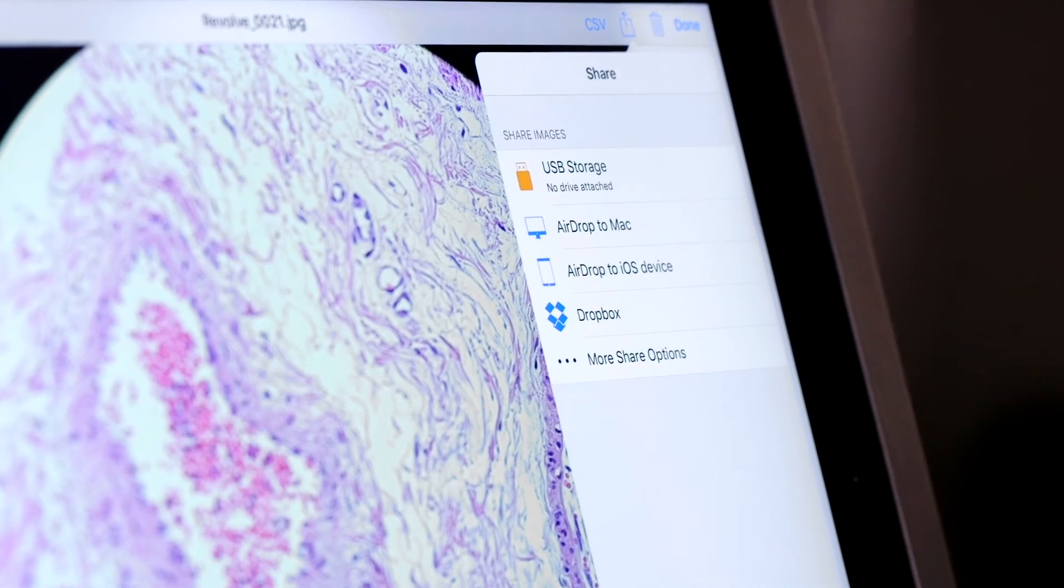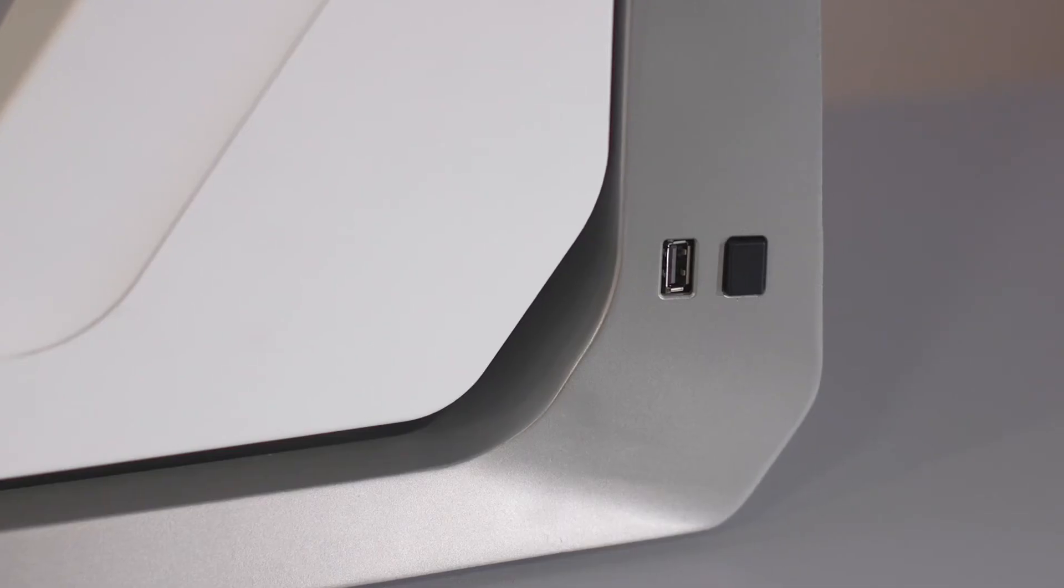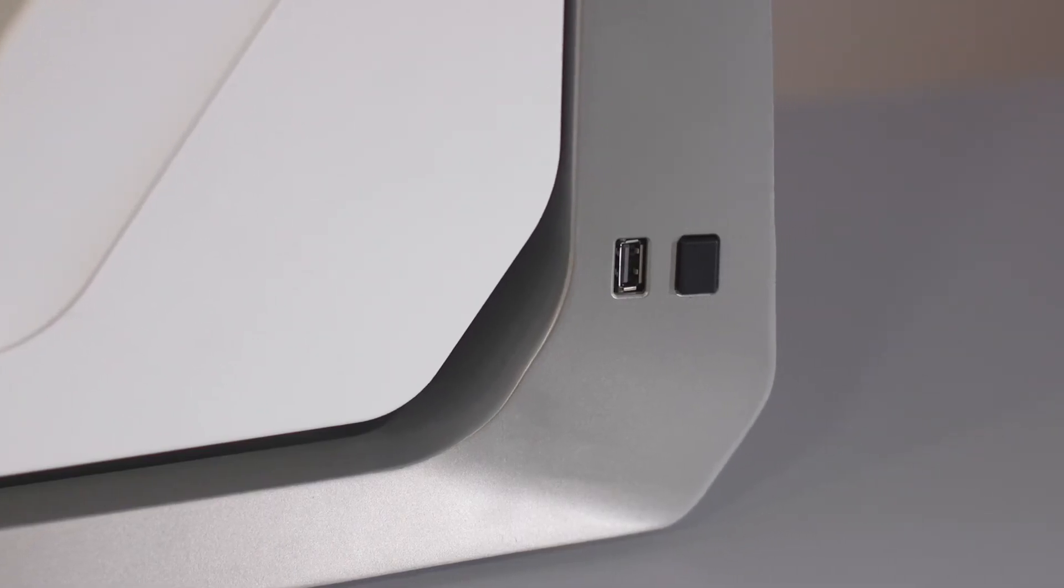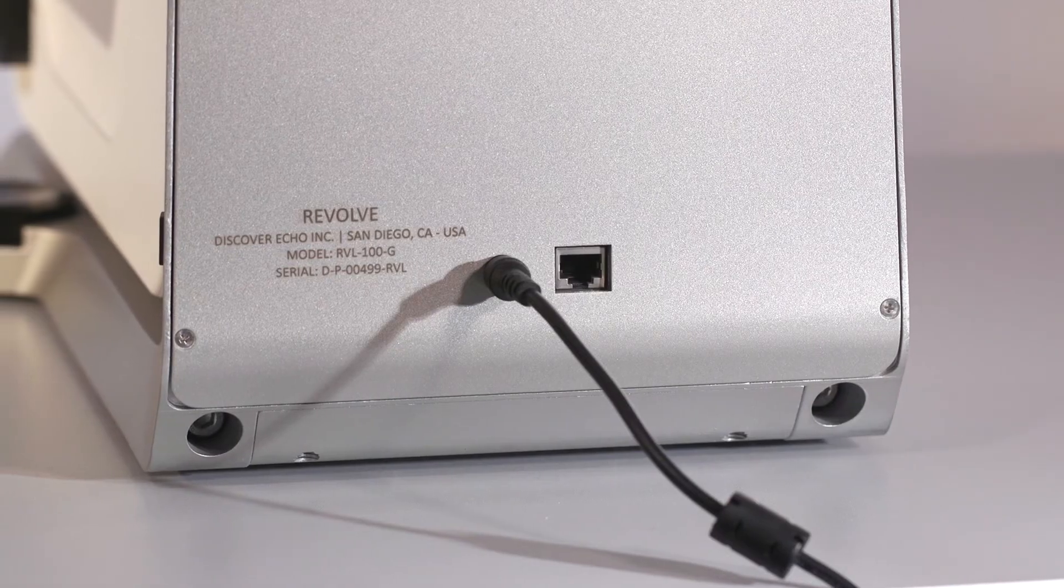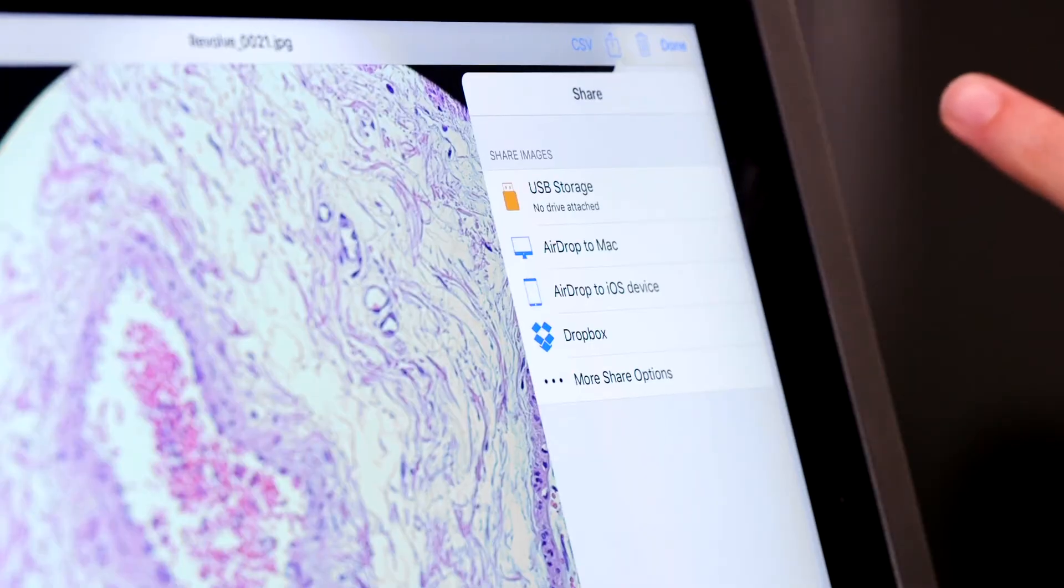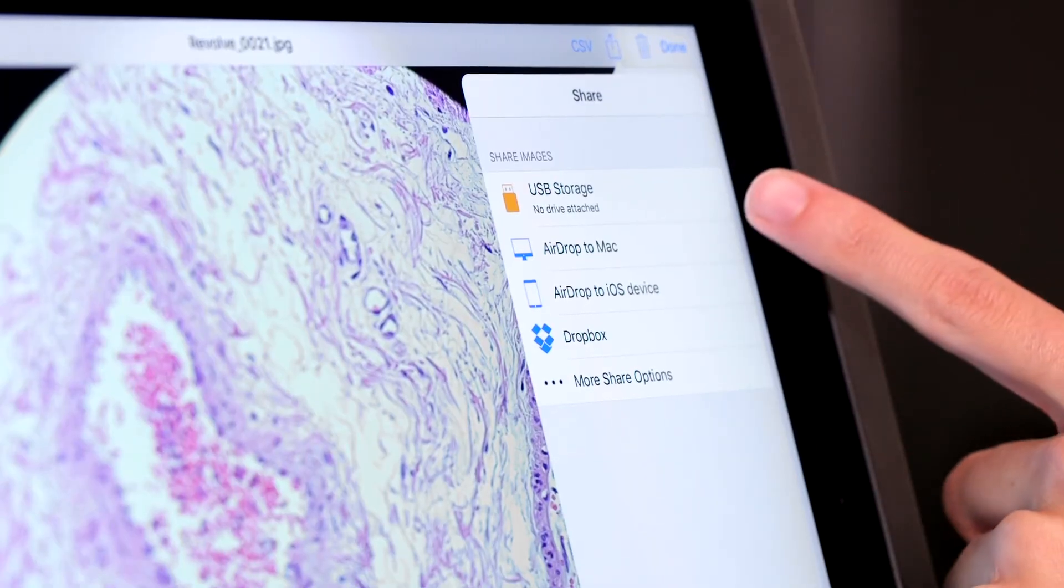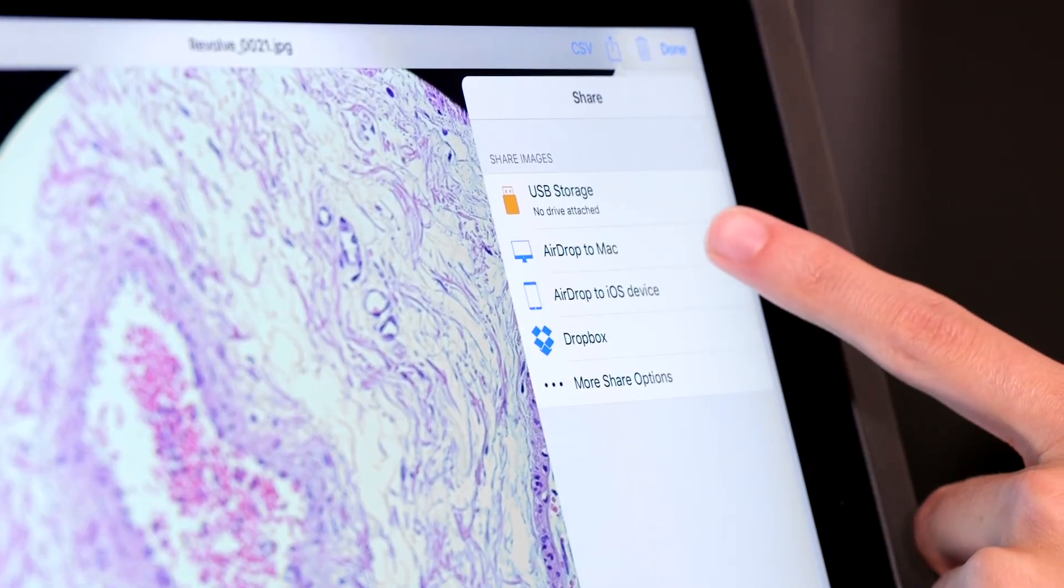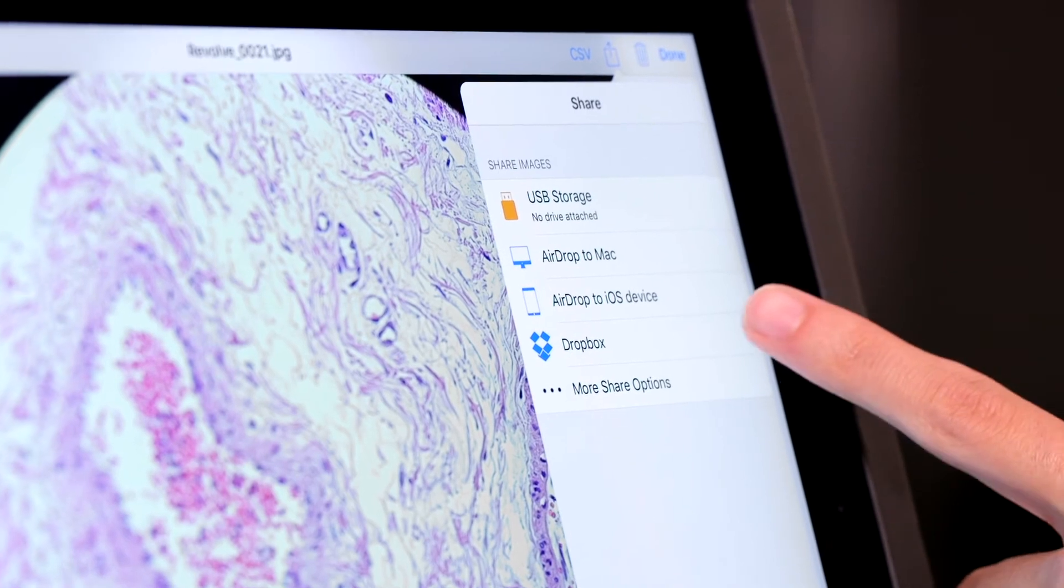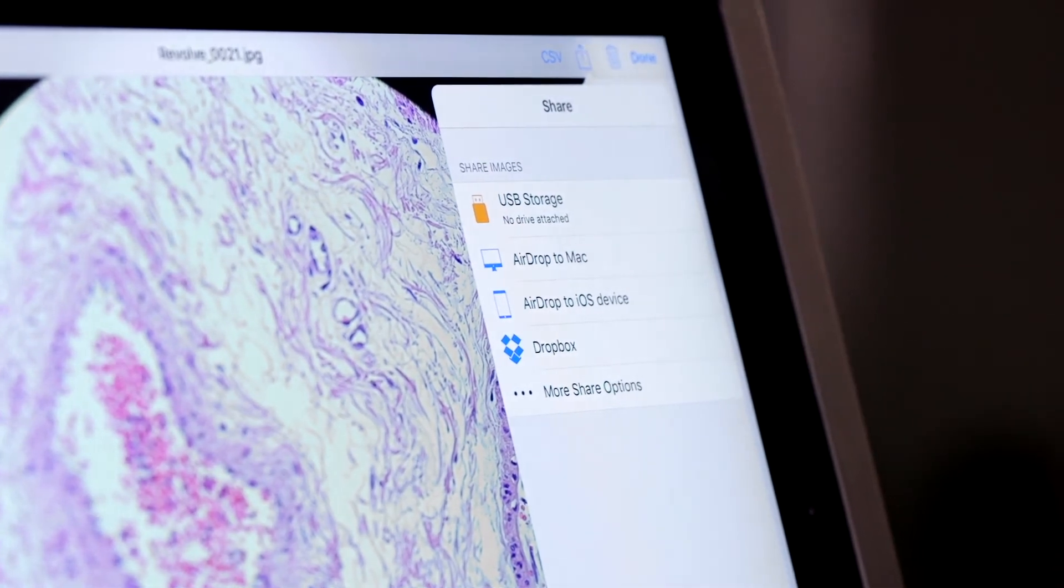To export our images, the Revolve offers USB and Ethernet ports. And, because we're using an iPad, AirDrop and cloud-based applications, such as Dropbox, are also available.